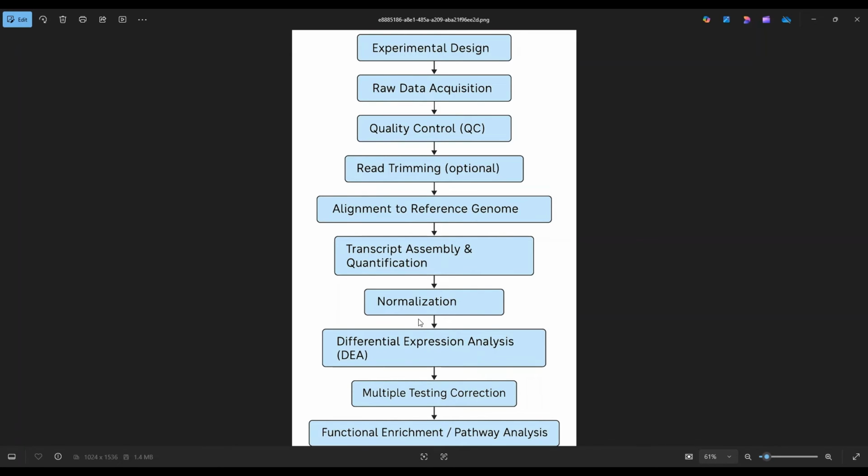And then after, when you have the BAM file, which is the aligned, indexed file, and that is compared with the reference genome, then we look for the counts. Basically, that count means how much each gene is amplified, or highly expressed or low expressed, in simple words. But what you actually get from different tools like HTSeq-count, featureCounts, Salmon is the count of reads per gene or transcript. So, the total number of counts of a gene.